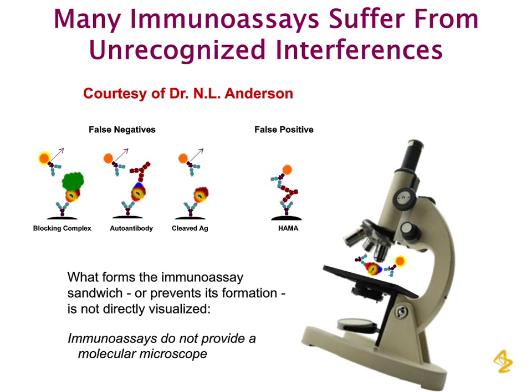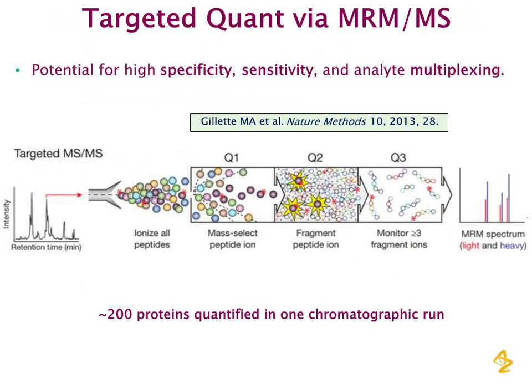Targeted MS technologies typically involve triple quadrupole instruments. These types of mass spectrometers have been used and refined for over 4 decades and represent the most robust instruments available for targeted quantification.